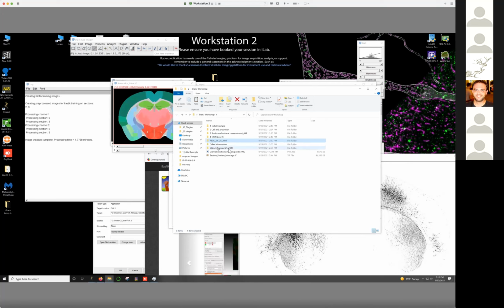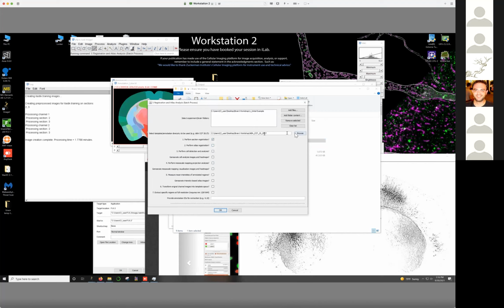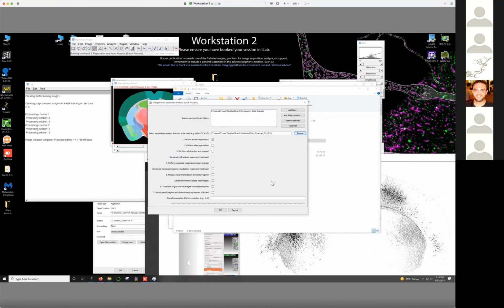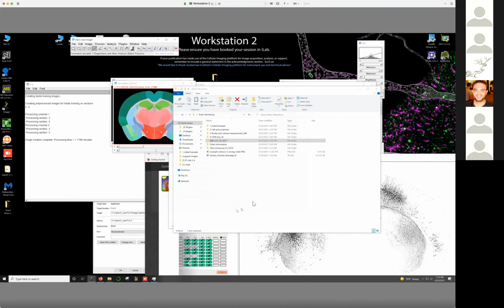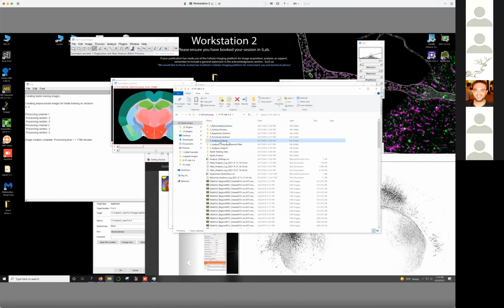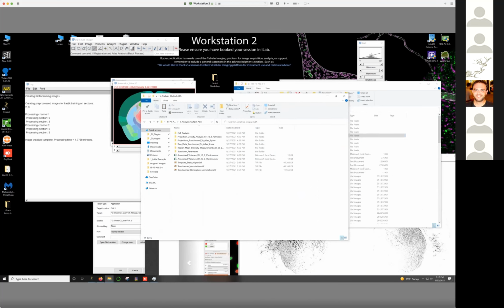You can also analyze using the Kim atlas. If you need to do that, it's just a case of running this step, but then choosing the new atlas. So you can choose, okay, I want to run the other atlas, and then you can compare results. If there's something interesting to you about this atlas and you want to cross-check with the other atlas, then you can run it with both. All you would have to do is, in fact, I've run it with both in this case. I would just rename this folder, and then rerun the pipeline with the different atlas, and then I would have another folder with the enhanced atlas output.